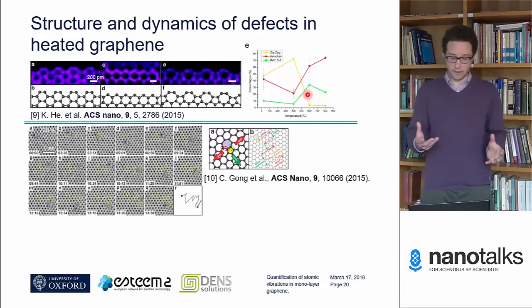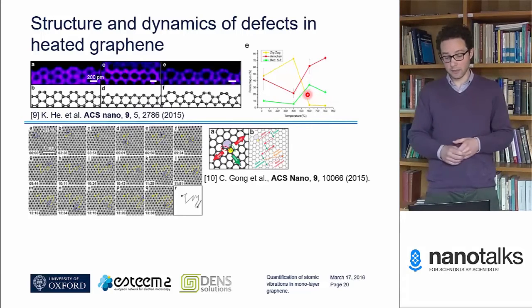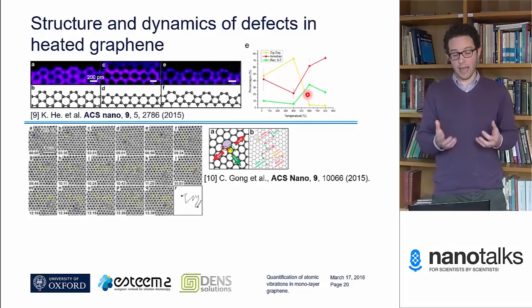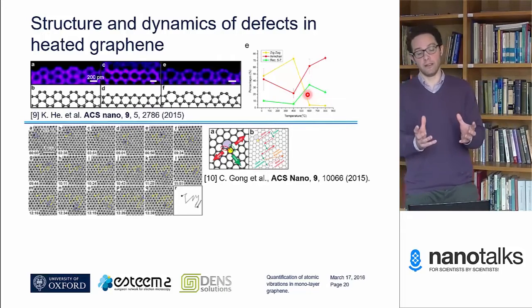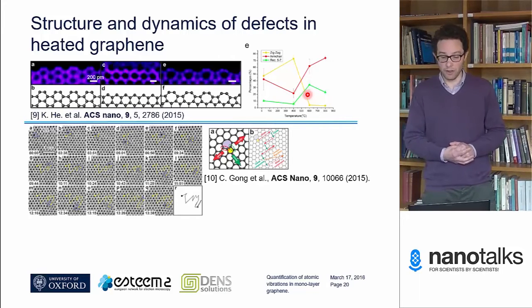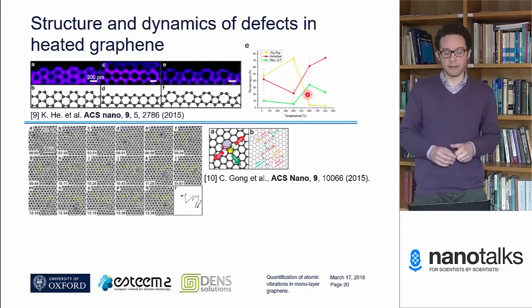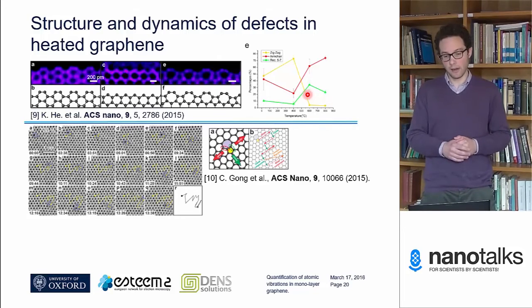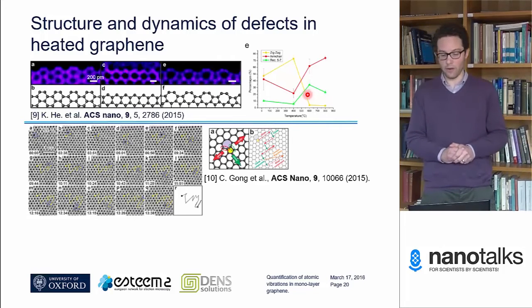Another piece of work, which is pretty uncontroversial really, looks at the defect dynamics of a reconstructed monovacancy at high temperatures. We found that as we increase the temperature, you increase both the glide and climb speed across the sample surface. So you're pumping more energy into the sample, and there's more energy for the defect to migrate around your surface, as you might expect. We also see some metastable intermediate states at high temperatures that we don't see at low temperatures, and most of this we can explain through the various energetics of the defects.